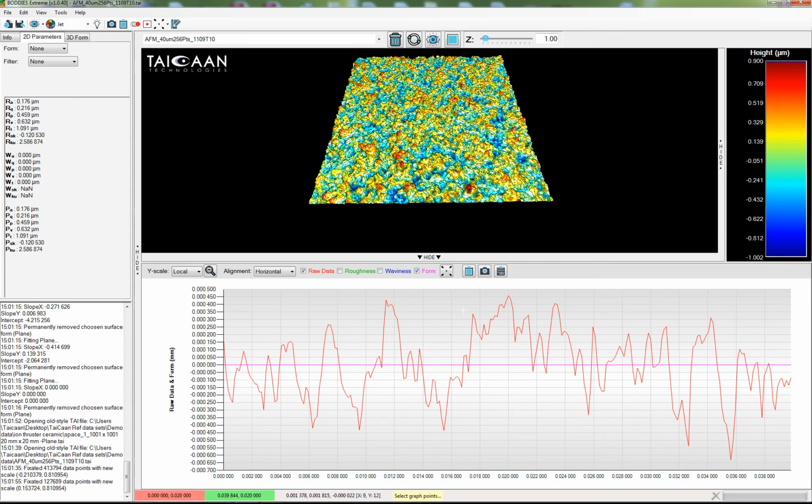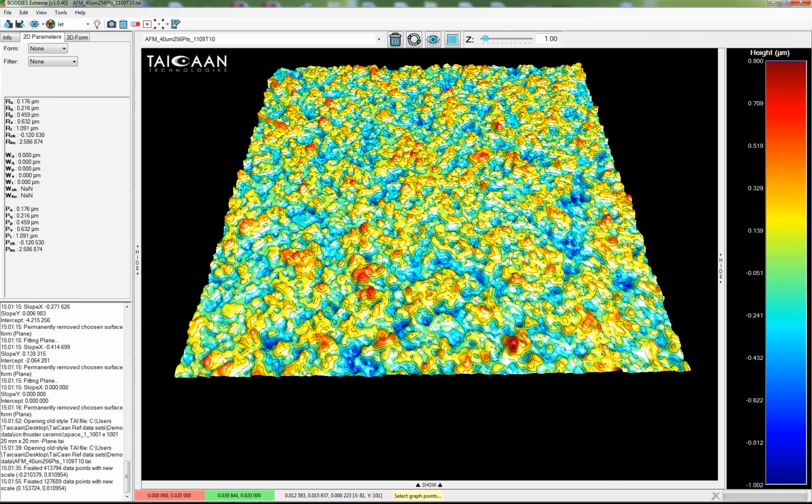I'll save that. The final part of this is another clipboard for the cross-section. What this does is it allows you to export the data of the cross-section in an Excel format so that you can import this into other graphing software, for example, the Excel program, and you can do your own analysis there. So that allows you to export raw data. Let's minimize this.